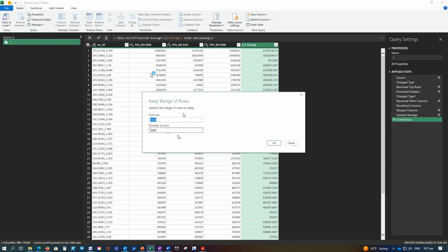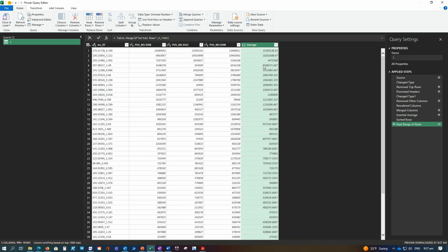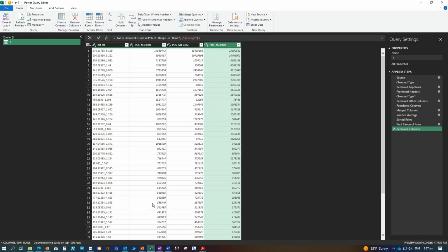This is sort of a unique case. You wouldn't always want to do this. The main thing you probably want to do here is what we demonstrated, where it's 1 to 5,000. You're only taking the top 5,000 based on mean intensity, and then you're just churning that because it's going to be your strongest signal. The data represents the strongest signal across all your samples. So yeah, that's how you do it.